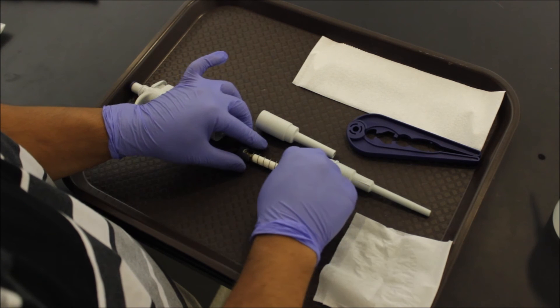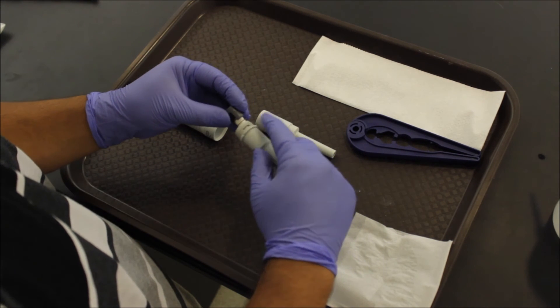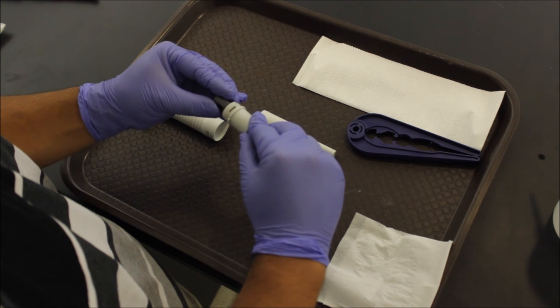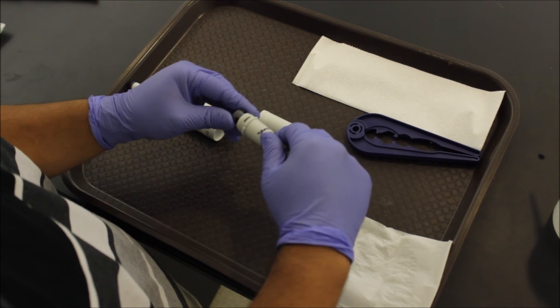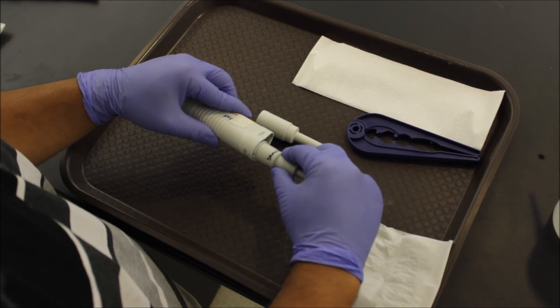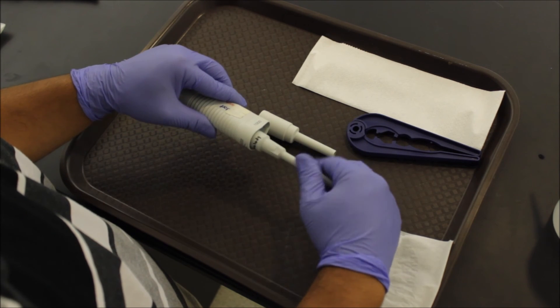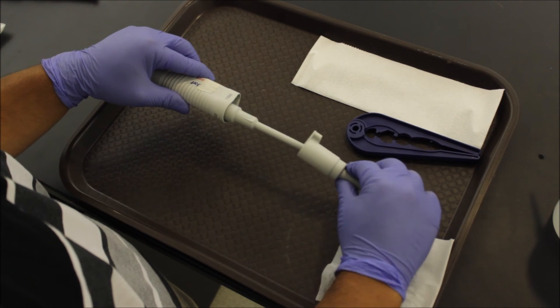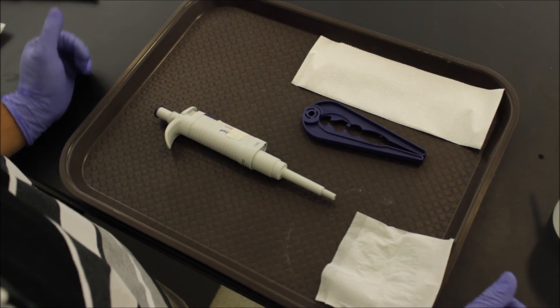Now here you have all the pieces. So for reassembling, I'm going to attach this core back into the inner barrel. Make sure this slides back into the slit. Now we're going to take this and twist it back into the pipette. Make sure it's nice and snug. Reattach the outer shaft. Once we do that, we're done.